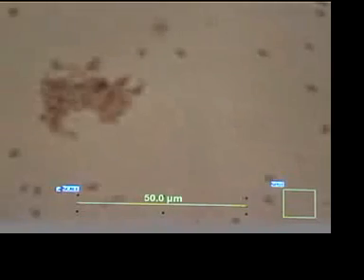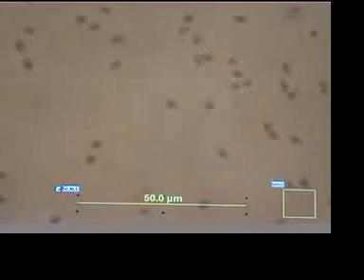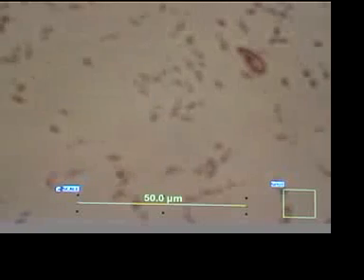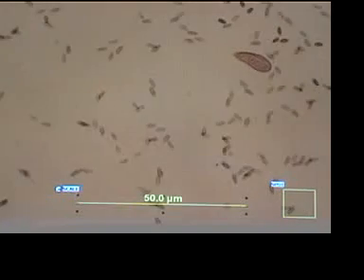There's another Blepharisma who was affected, but there you can see a little tiny guy swimming around. Let's see if we see any clusters. Here's a little group of small organisms swimming around, but still, it could be that the water. Here's a good cluster of organisms swimming around. Let me focus that for you. I'm doing this in real time here. Oops. Here we go. And there's one.